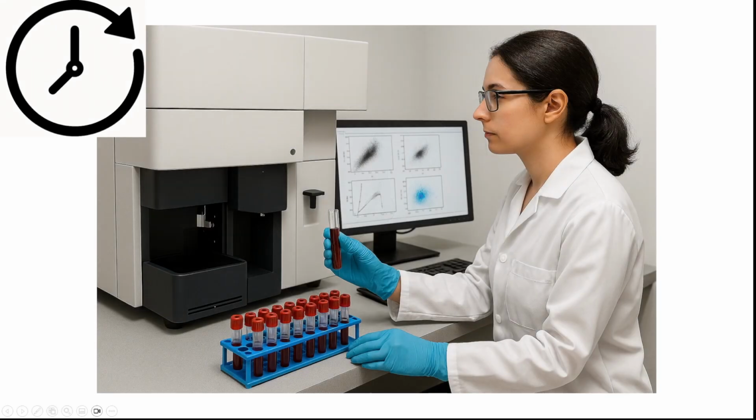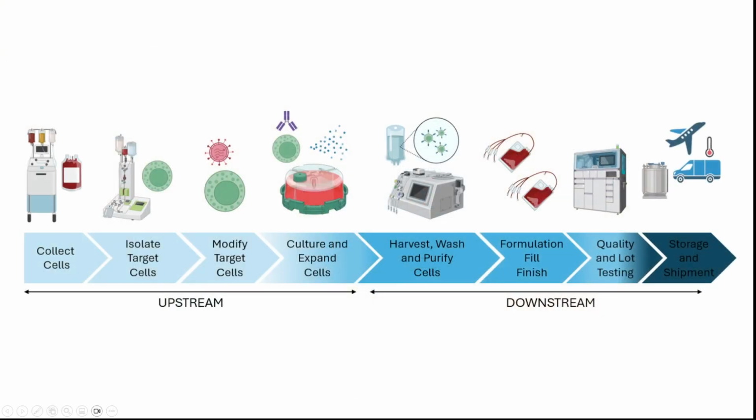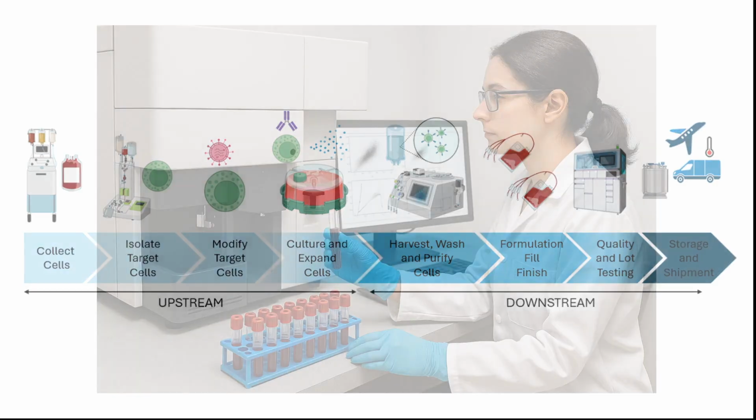So the turnaround time really matters when supplying flow cytometry characterization data to developers. If a collection center sends out a sample for flow testing or performs traditional flow cytometry on site, the data may not be available until after the leukopak arrives at its final destination. This may make the data useless if the developer needs it to adapt their manufacturing procedures. When flow data is available soon after collection, programs can begin immediate planning to stay on track.